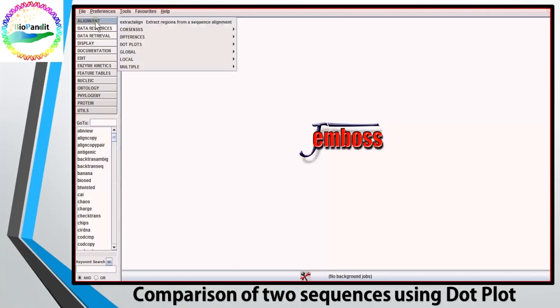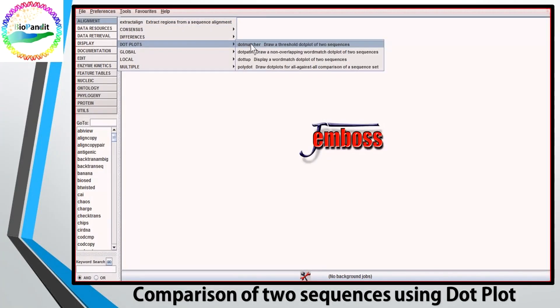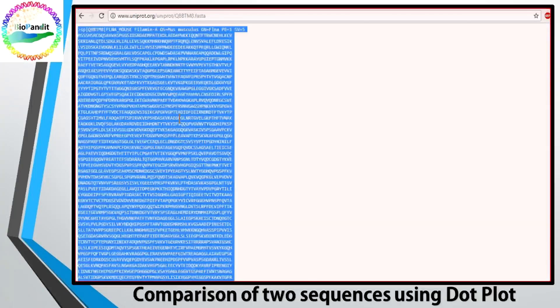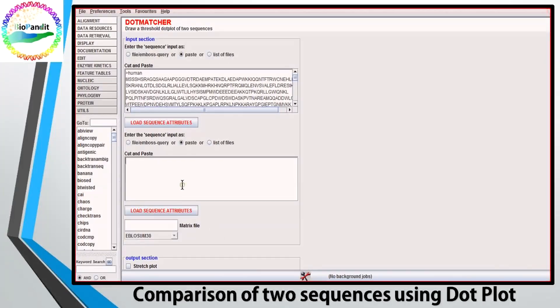Now let me perform the same operation for mouse. Now we need our dot matcher program. It is implemented in the EMBOSS package. The method is very simple. Two sequences are needed. You can either browse your sequence file or simply copy and paste your sequences.